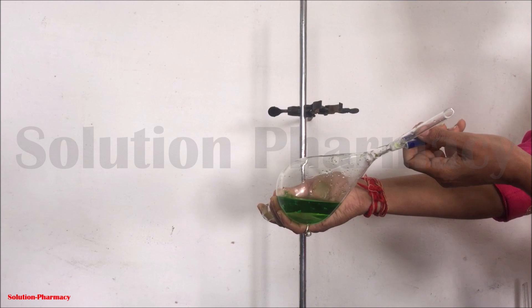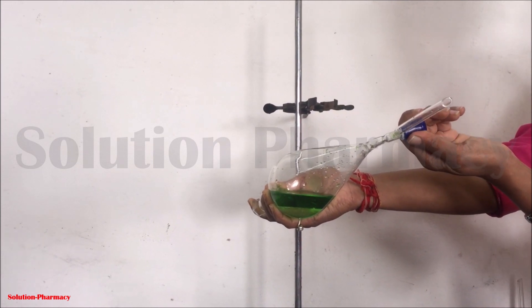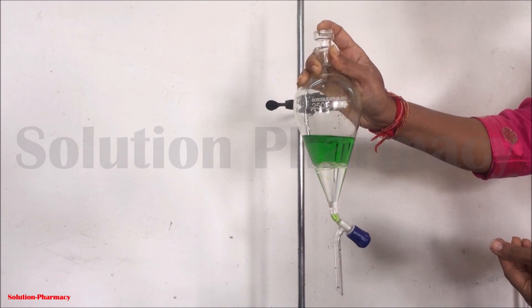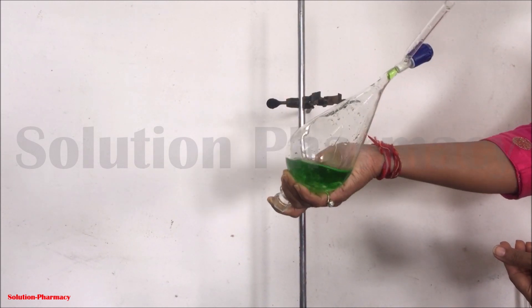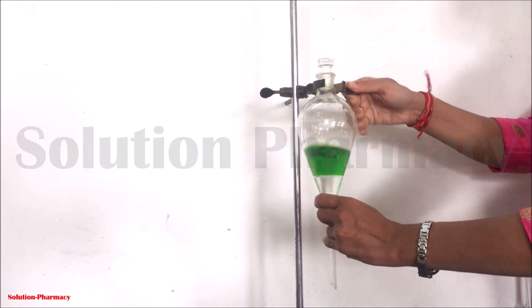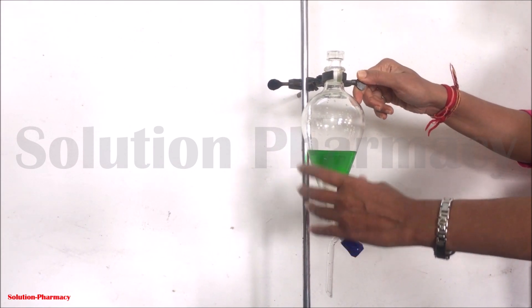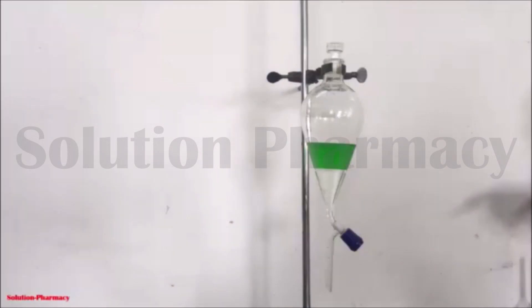After performing the inversion two to three times, release the vapor pressure developed inside the separating funnel. To do this, completely invert the funnel and slightly open the stopcock. You can hear a whistle, which is due to the release of vapor pressure. Tightly close the stopcock again and repeat the extraction process — inverting and returning to normal position — two to three more times for complete extraction.